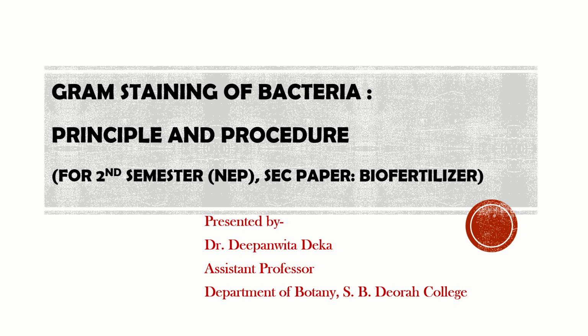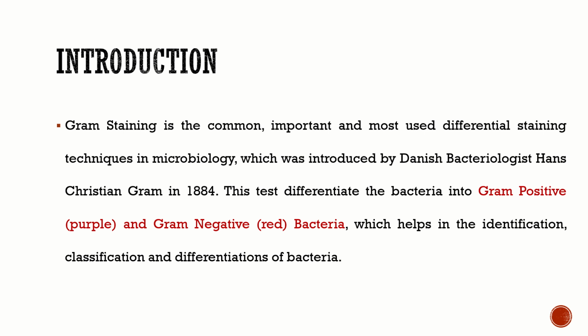Today we will discuss a new topic, that is gram staining of bacteria, principle and procedure. This topic is included under the paper Biofertilizer SEC paper for second semester NEP students. So before going into detail, let me give a brief introduction on gram staining.